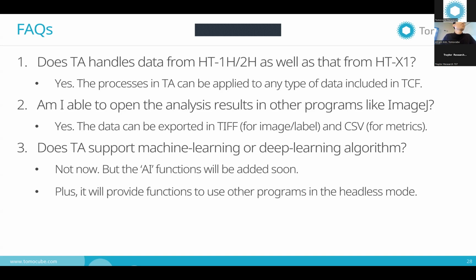In your backend, do you take one slice and see if it's a circle or not, or do you take a whole sphere as a whole? Like for a lipid droplet, in your backend, do you select the center and see if it's a sphere, or do you go slice by slice and see if all the slices are circular or not?